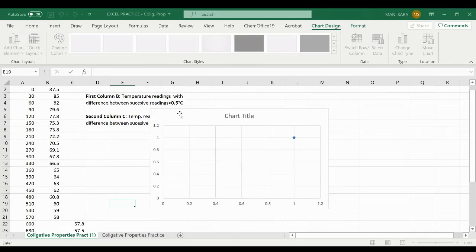You are going to add the first series. And you click here in the middle, series X values. Our X values are always the independent variable. So the temperature is read every 30 seconds and does not depend on the other.